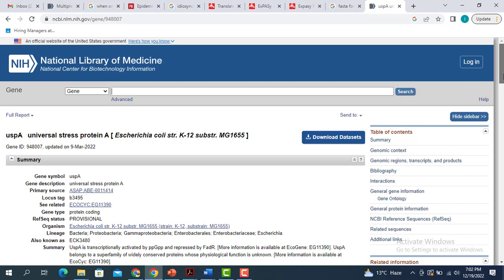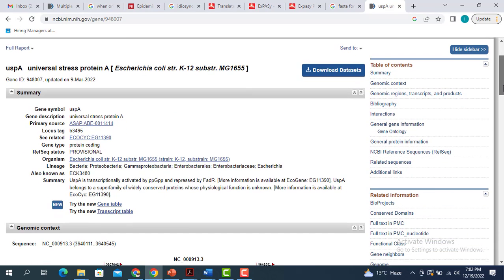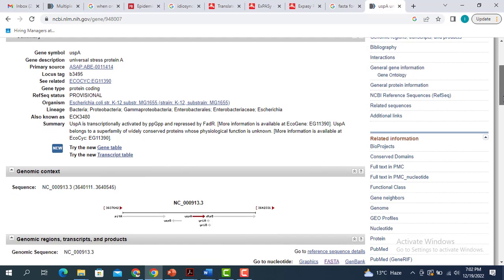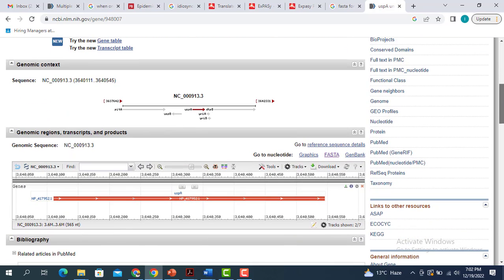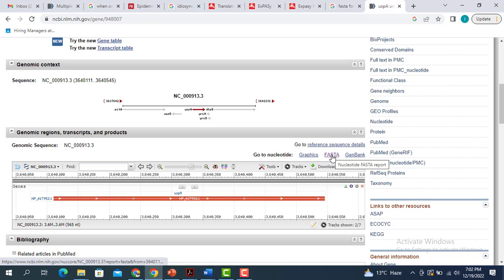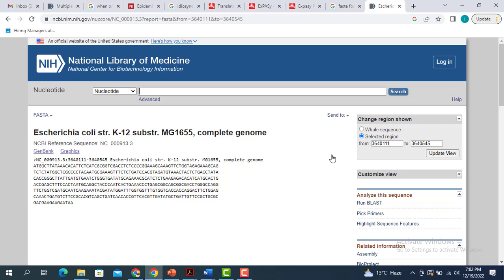I'm not going into that. We are only interested in retrieving the FASTA sequence for this particular gene. So we come straight down to the genomic region, the transcript, and the product part. And here you can see this one is the FASTA sequence. When you click on this, it's going to give you the FASTA sequence for this particular gene.